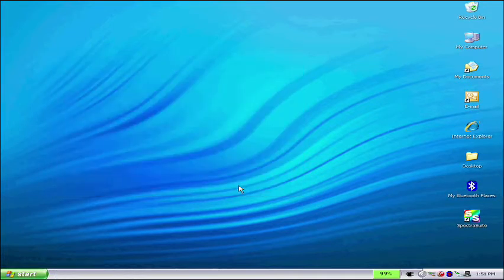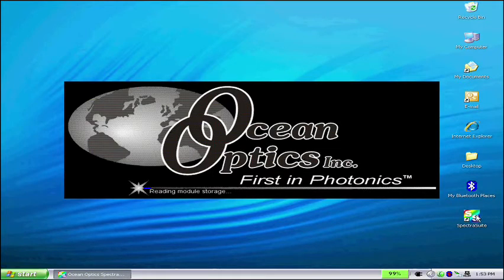Now that the device drivers are installed, you're ready to start using SpectraSuite. In Windows, simply click on the SpectraSuite icon. You're ready to go!